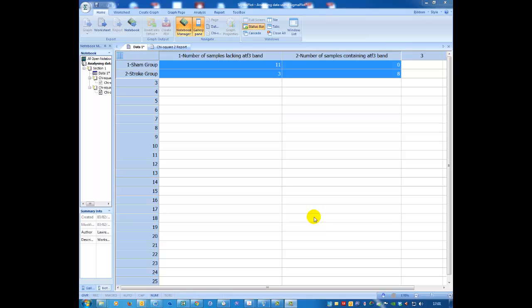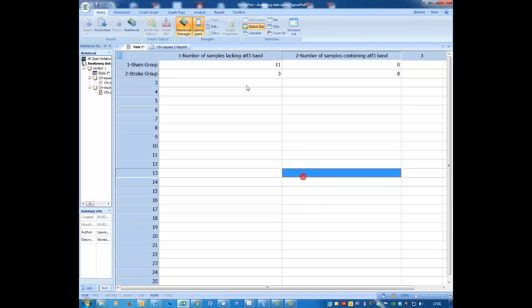Okay, so now I'm going to show you how to analyse your sample data. Here you can find the sample data you've already seen. In this PCR practical, we need to do one more thing. In this particular measure, you want to see how many experiments show a band in this column here.